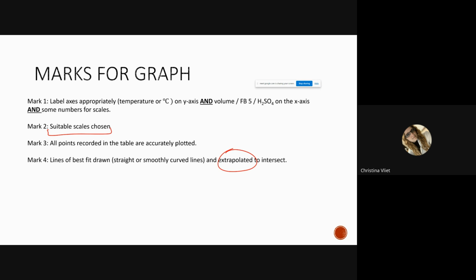Oh, the lid. Improvements. So it says don't change the apparatus. You have to do something else. It's an apparatus, that's the measurement, right? So what else can you do? One mole. For example, add smaller amounts at a time. Take more points, right? You could add smaller amounts at a time. You could mix the whole time without stopping. Constantly mix. So there are options. How could you do better? How could you do it better?